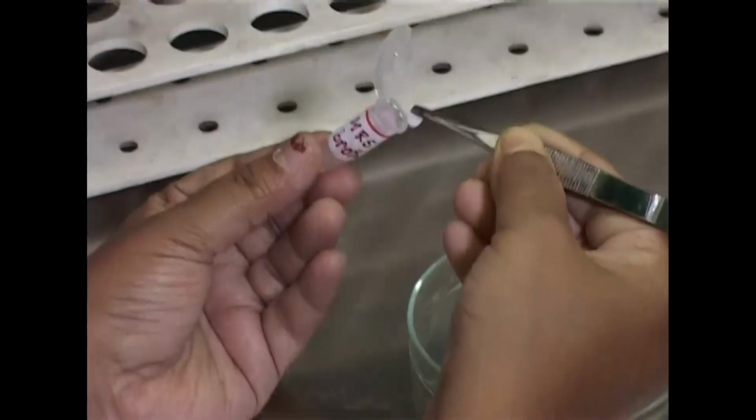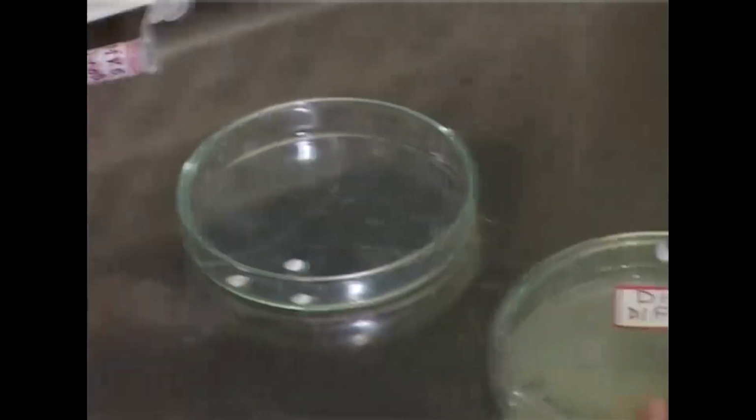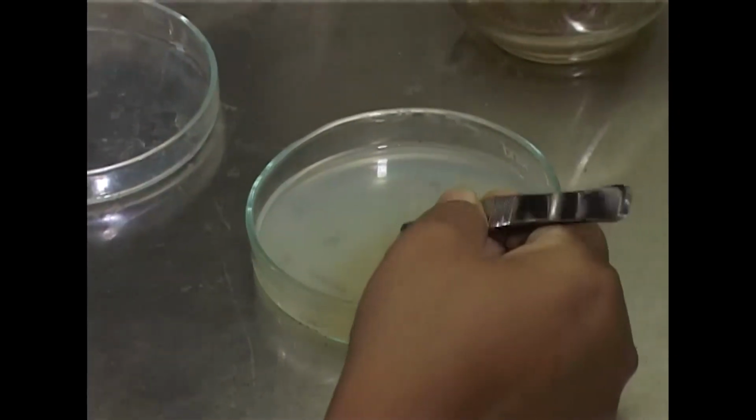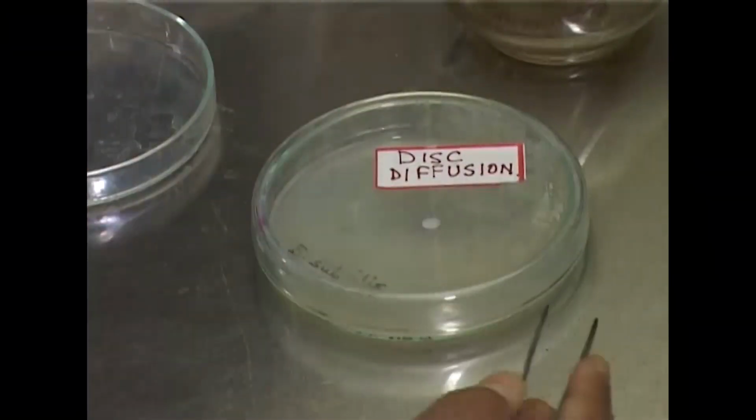Antibacterial activity. Now, the 0.2 micrometer discs will be pre-soaked with the MRS broth containing the specific culture and will be placed over the nutrient agar medium. And the disc diffusion study will tell you about the antimicrobial activity of the particular isolates. And the organisms against which the antimicrobial activity will be studied are E. coli, Staphylococcus aureus, Pseudomonas aeruginosa as well as Bacillus subtilis.